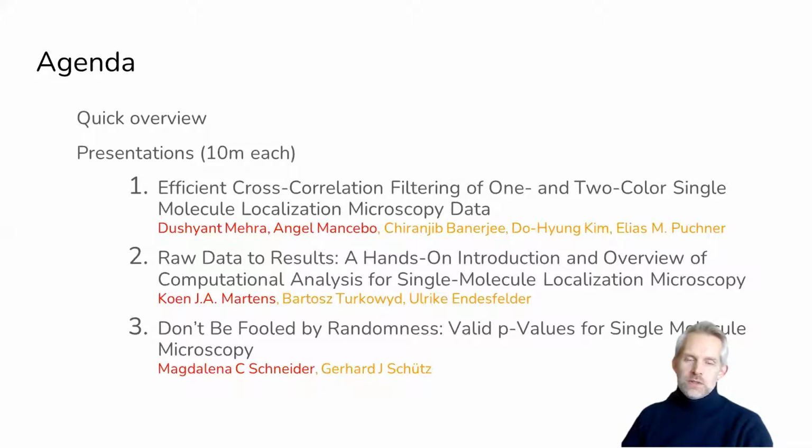After a quick overview of the idea behind this workshop, we'll dive into presentations. We have 3 presentations, each 10 minutes, which will be part frontal presentations and part demonstrations of the associated software.